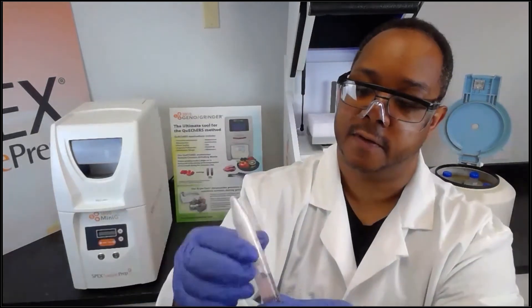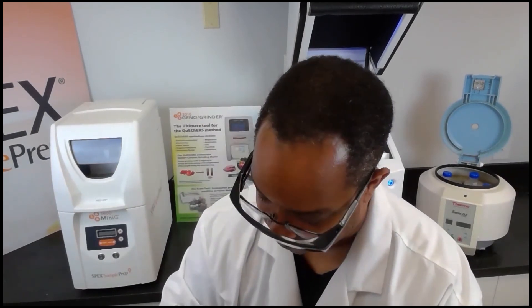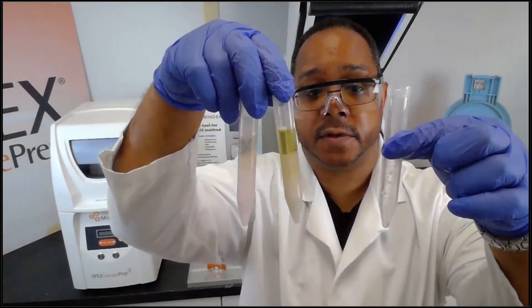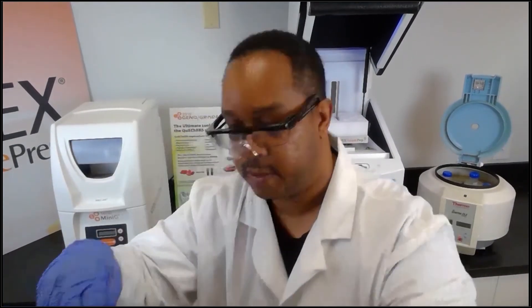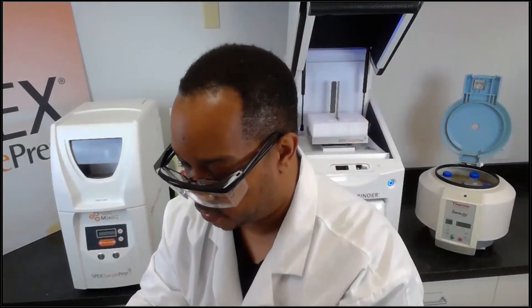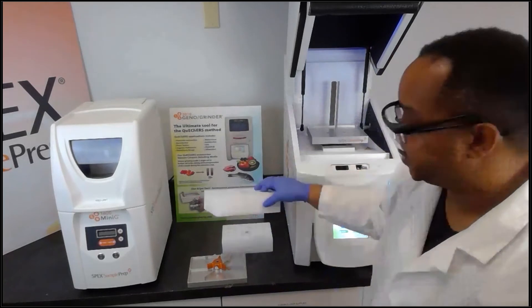We add the liquid to the salt matrix tube, cap it off, and give it a little shake. I've prepared the other samples with the extract as well.